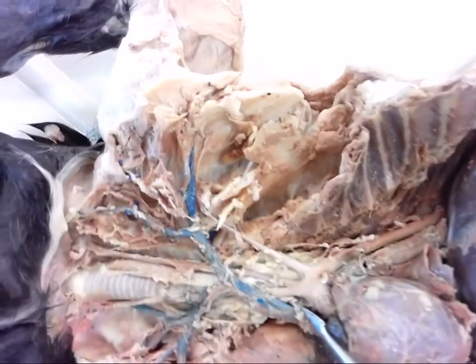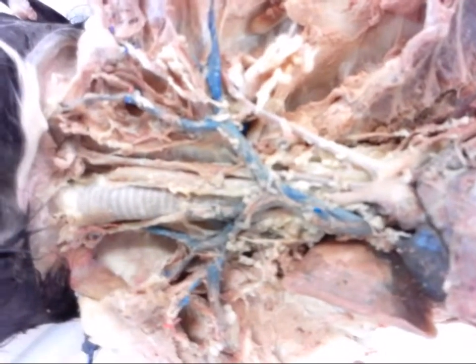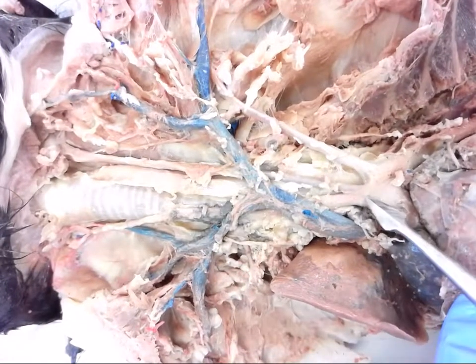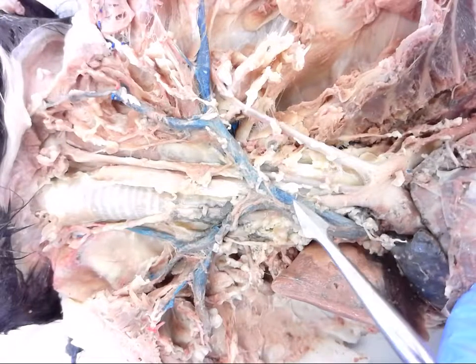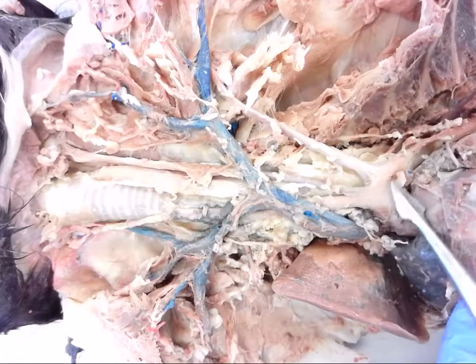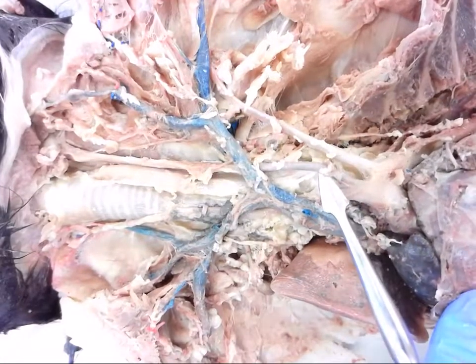All right. So as mentioned, we have a branch here, and this is your brachiocephalic. I'm going to zoom in real quick, see if I can't get a little bit better view of that and focus. And so we have one branch right here. This is the brachiocephalic. Here's your left common carotid. As I mentioned, it comes off very early. This is much earlier than it normally does.